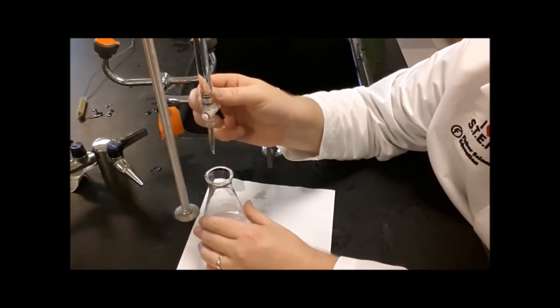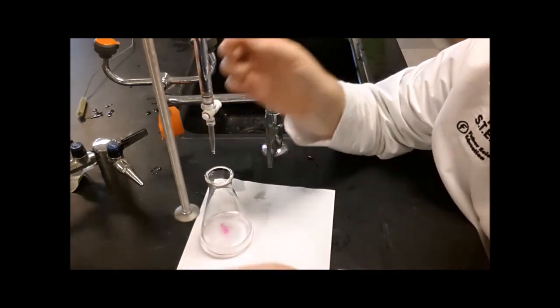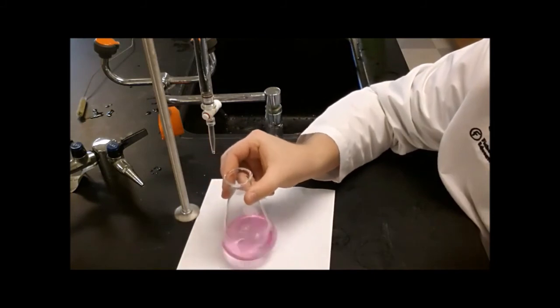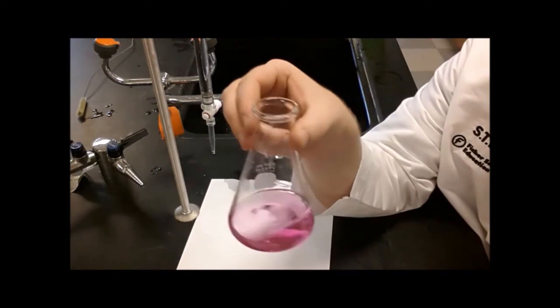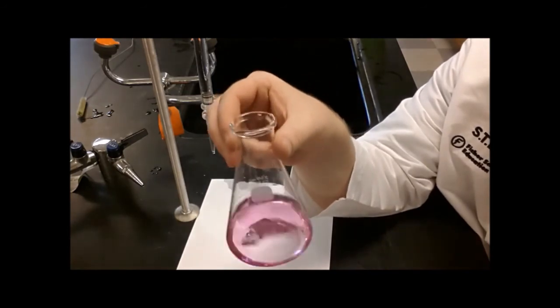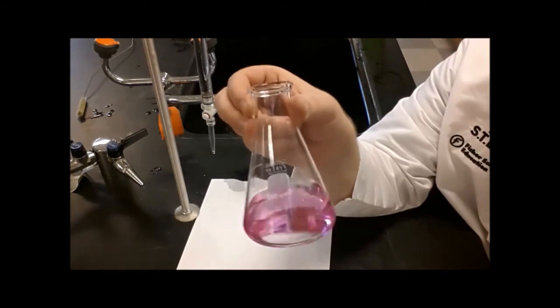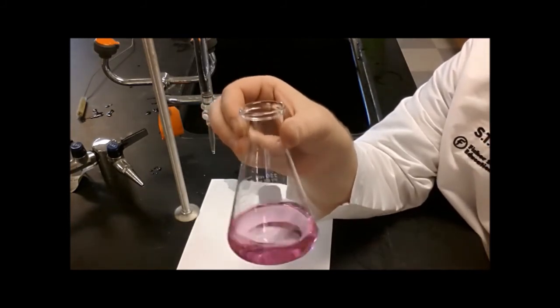I have a droplet of sodium hydroxide, and that is how I get 1 droplet at a time. Very slowly, very carefully, as I get towards the end point, 1 droplet, and see all that pink? And if I swish this around, that's pink, but that's not as violent as it was before. And what's the difference in volume between 1 drop? It's not a whole lot.